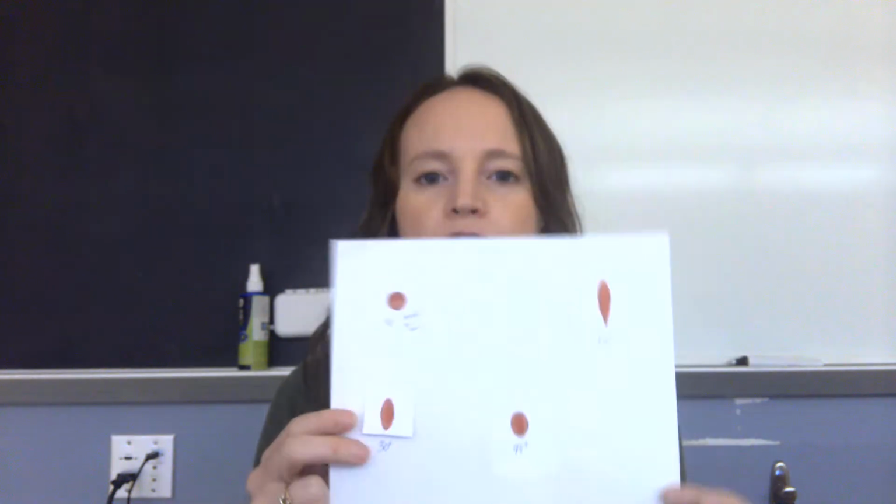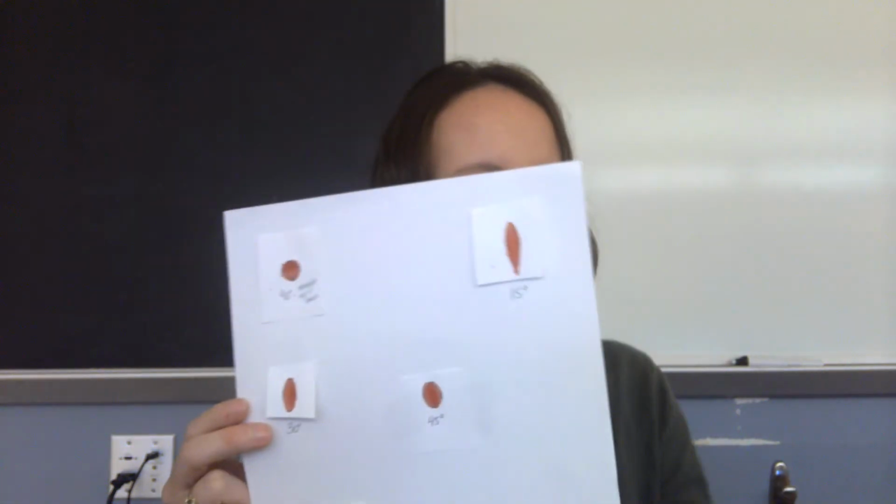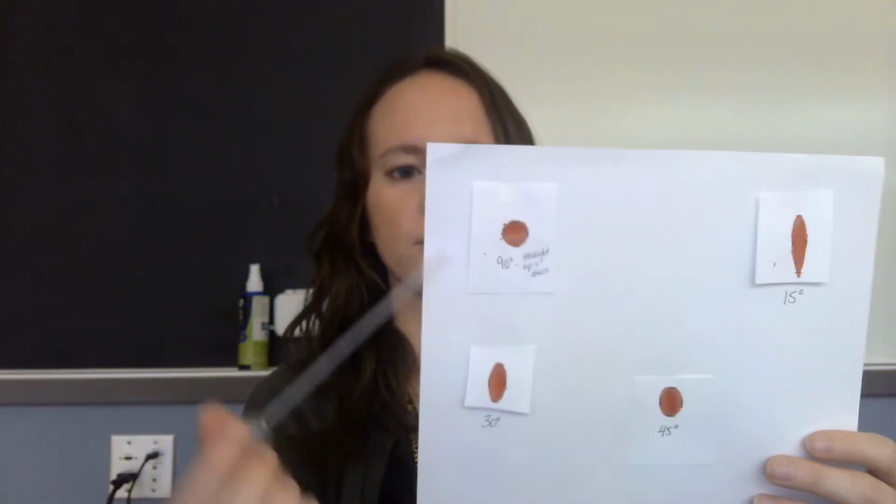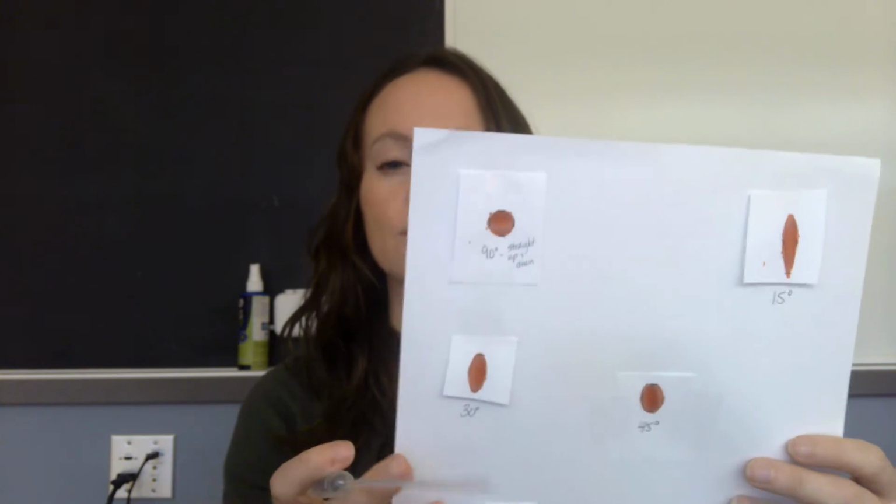All right, so you have your data table open. What we did was take the paper, instead of throwing blood at a surface at an angle, we angled the surface and dropped the blood straight down to simulate it. So the first angle in your data table is 90 degrees. That is actually what we're considering straight down, perpendicular. So that was just like the first part of the lab, it was dripped straight down.